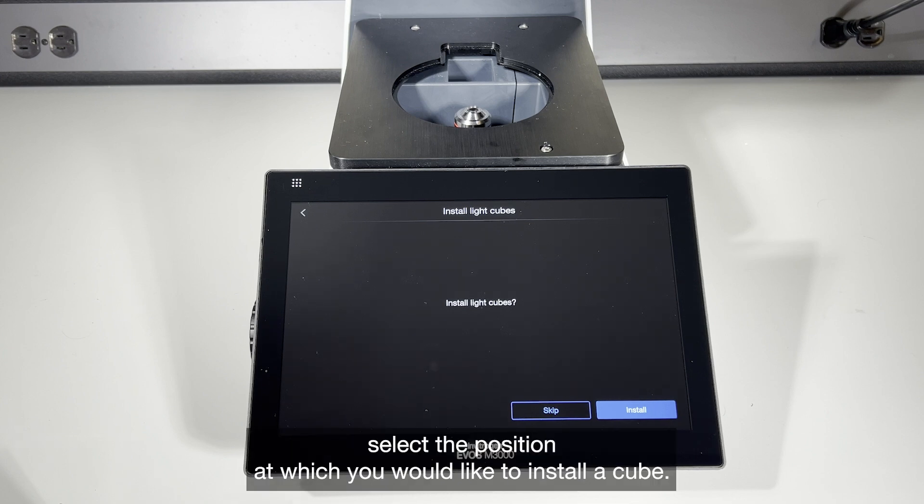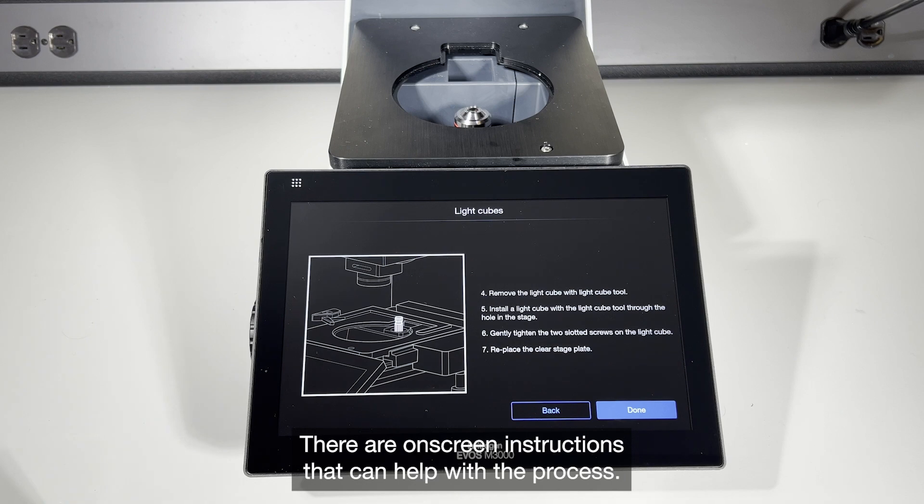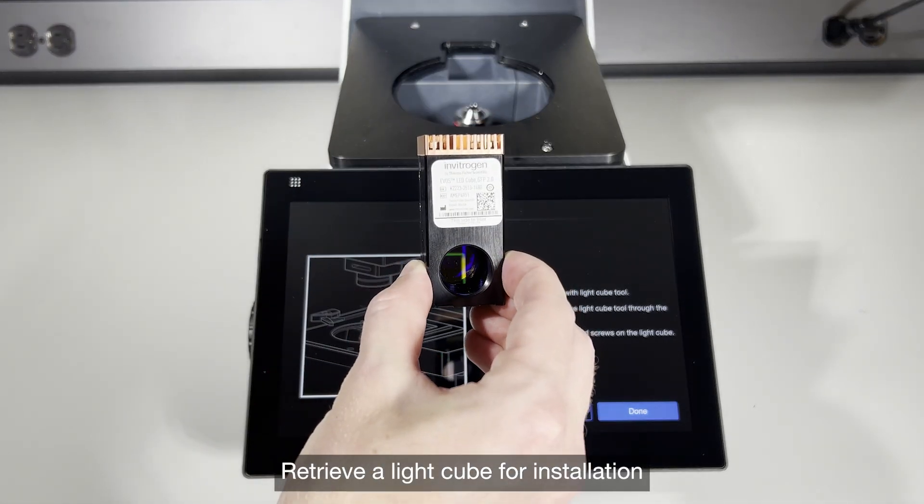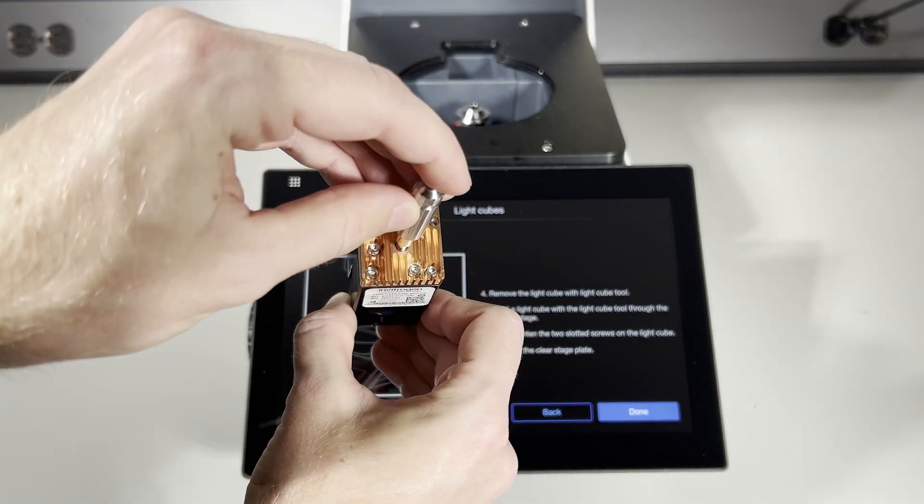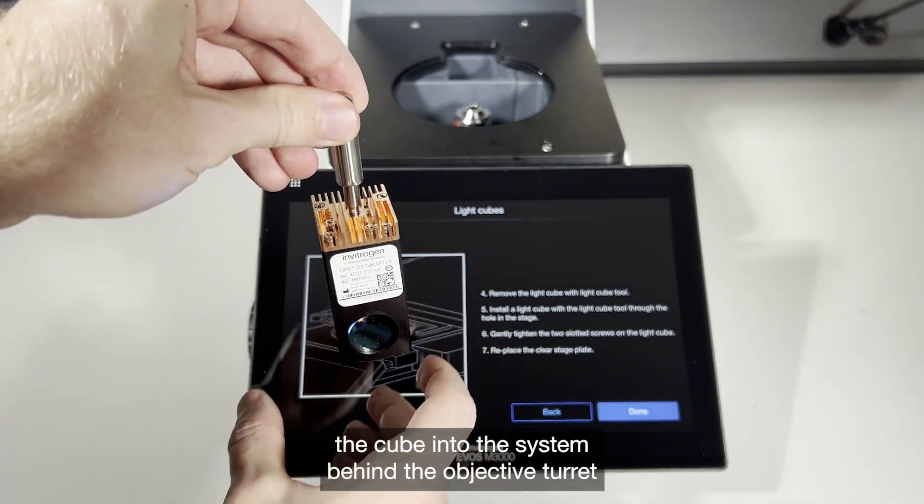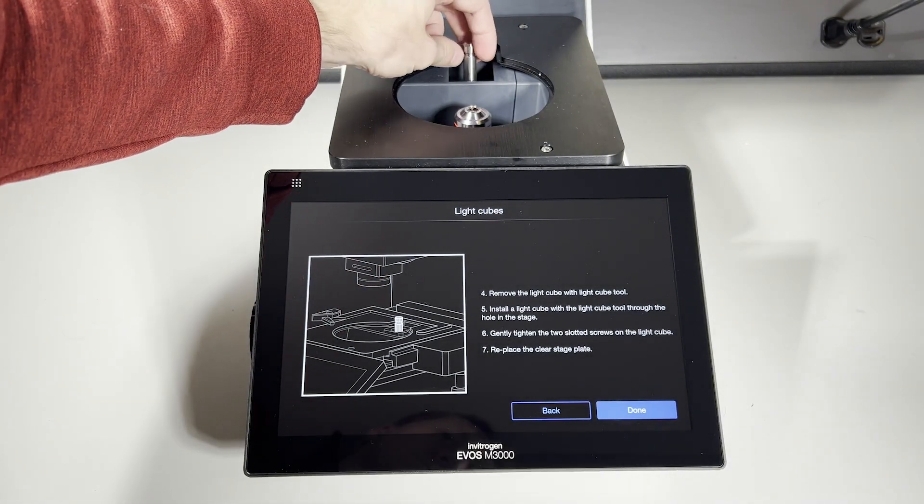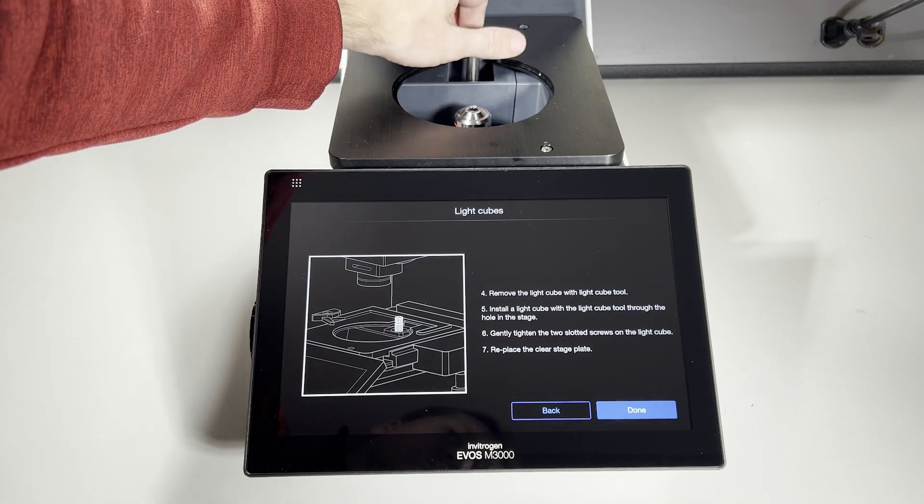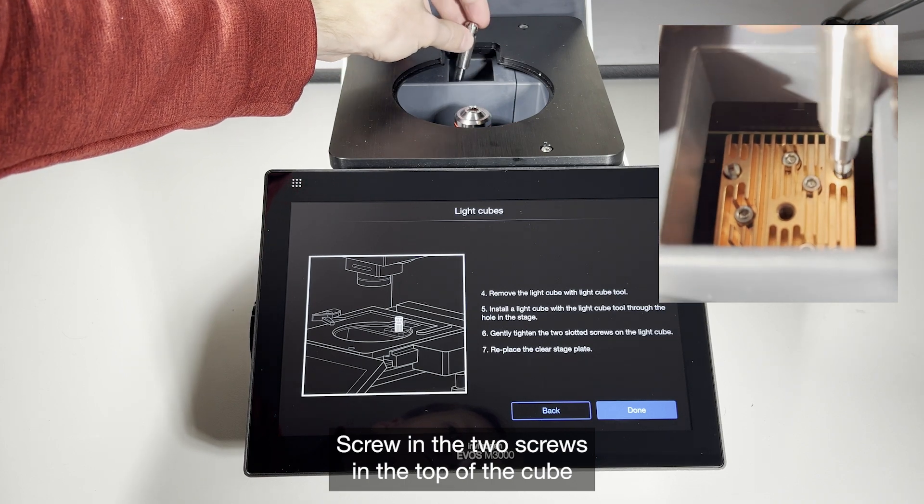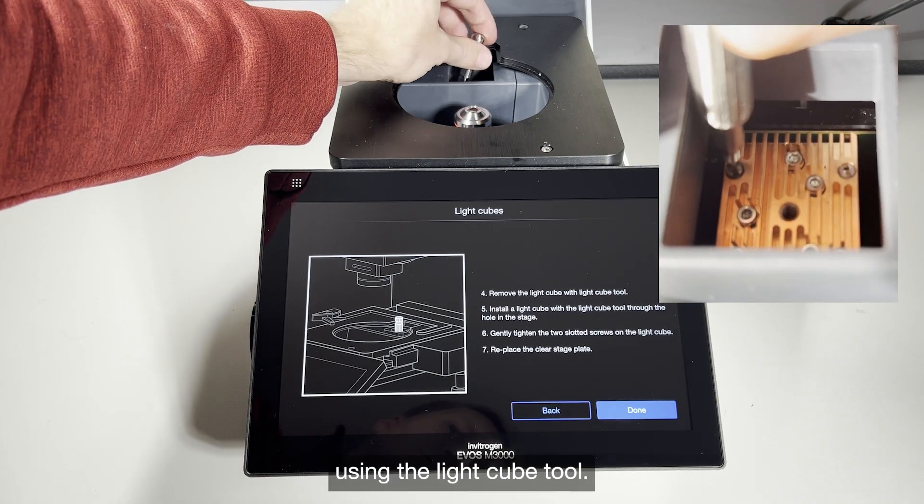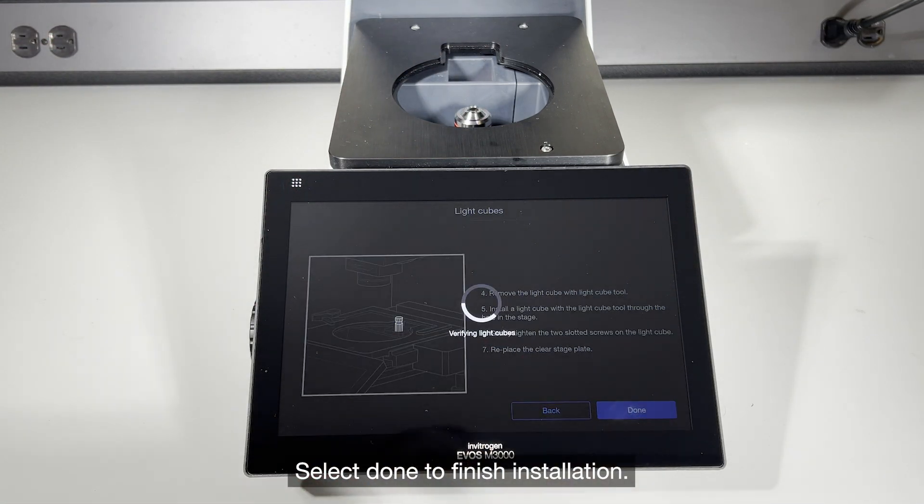If installing light cubes, select the position you would like to install a cube. There are on-screen instructions that can help with the process. Retrieve a light cube for installation and screw the light cube tool into the top of the cube. Lower the cube into the system behind the objective turret with the sticker right side up facing forward. Screw in the two screws in the top of the cube using the light cube tool. Select done to finish installation.